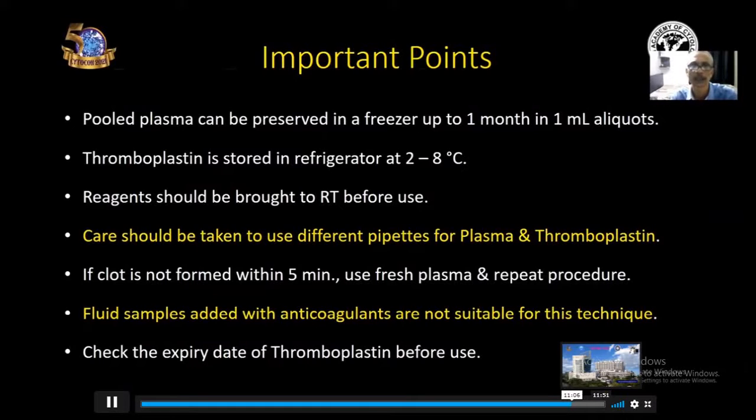Thromboplastin is stored in the refrigerator at 2 to 8 degree Celsius and all reagents should be brought to room temperature before use. Care should be taken to use different pipettes for plasma and thromboplastin.